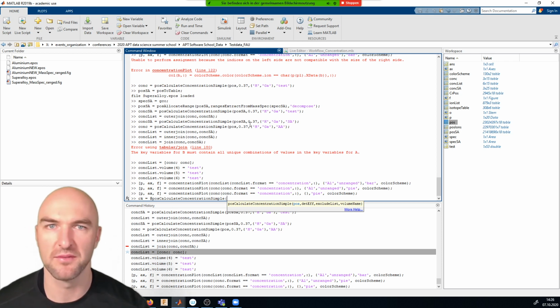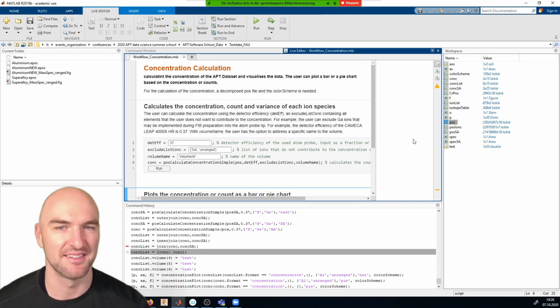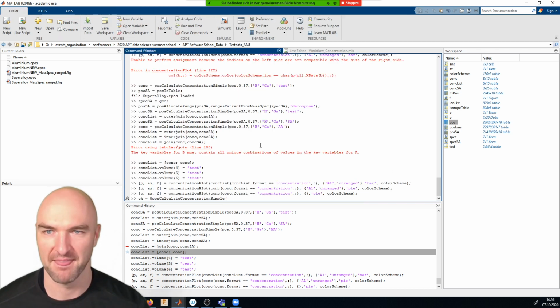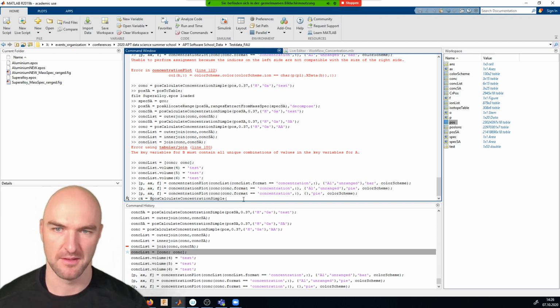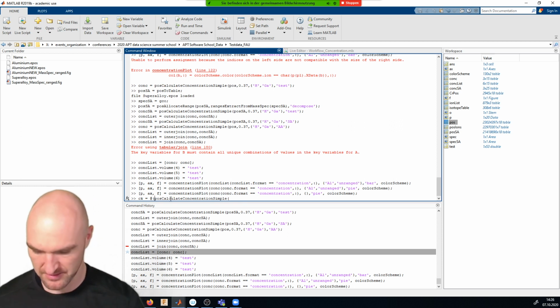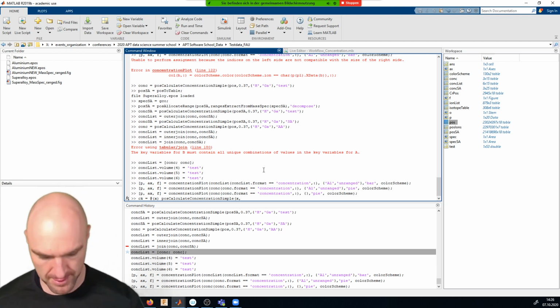Great, now I've lost my plot. Oh no, sorry, at x pos concentration calculation simple x 0.37.